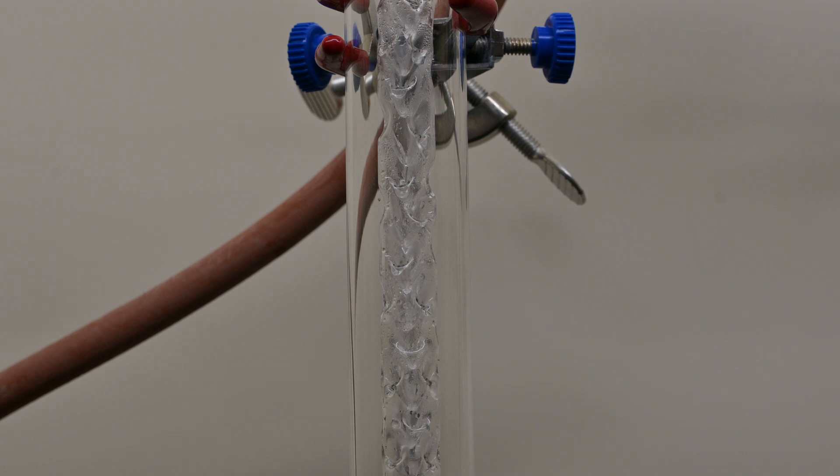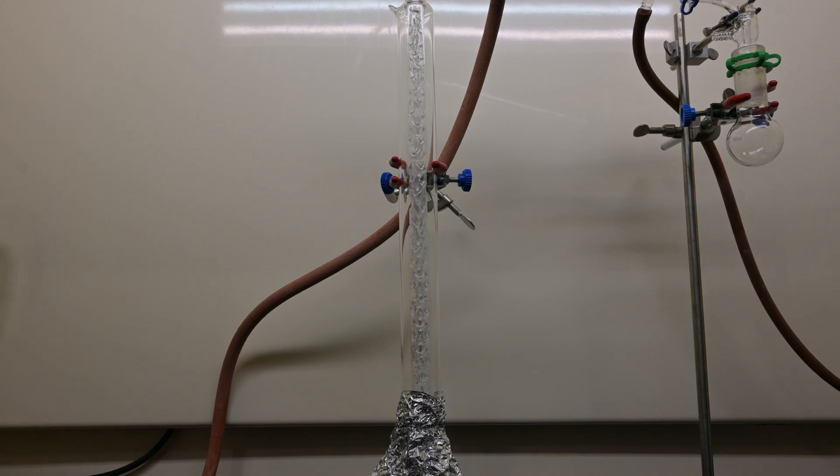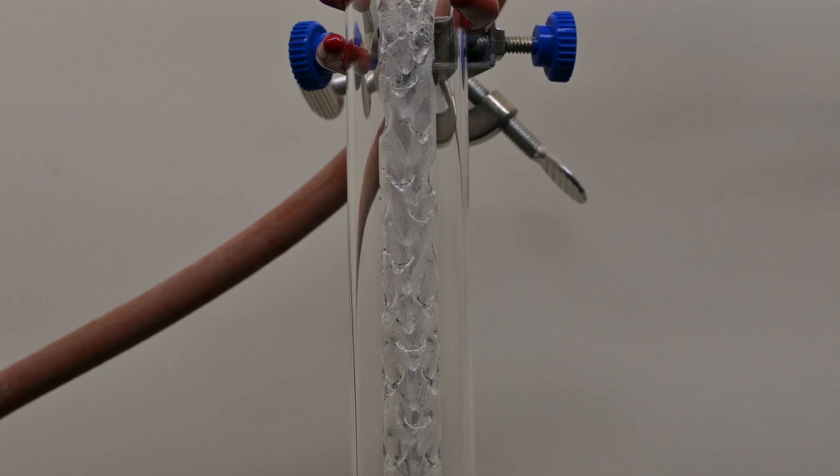The Vigreux column allows for better separation of mixtures by providing a place for the vapor to condense, resulting in a more efficient distillation process. Only substances that boil at the current temperature of the column will make it over to the collection vessel, while higher boiling point compounds will condense and run back into the boiling flask.